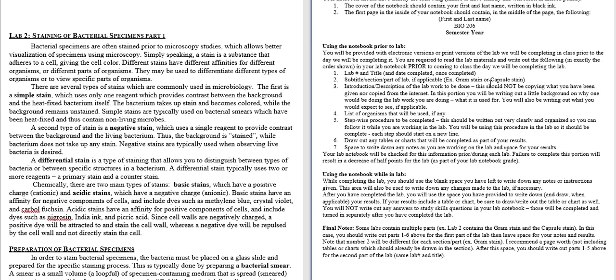And then at the end of the semester, your 100 points that go to your lab notebook are all going to be based on your unknown, as well as that you have completed these things each week. So you have signatures and dates for each of these things that you've prepared ahead of time. So here we are. The very first thing that you need to write in your lab notebook for a particular lab each week is on the very first line, you write the lab number and the title.